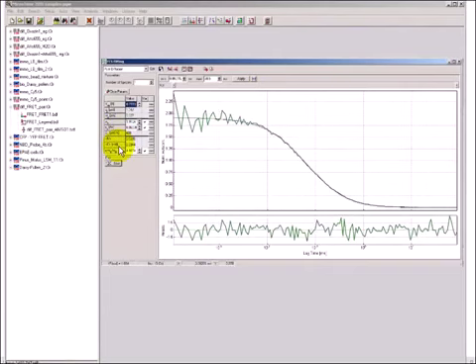The fitting can be extended to more complicated models, including several diffusing species, triplet photophysics, as well as restricted diffusion, to name only a few. A bootstrap analysis allows to quantify the measurement uncertainties.